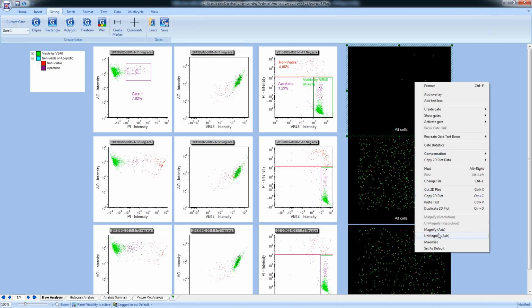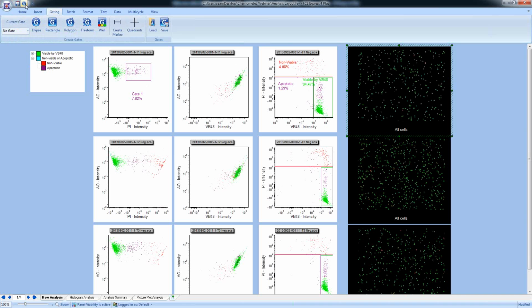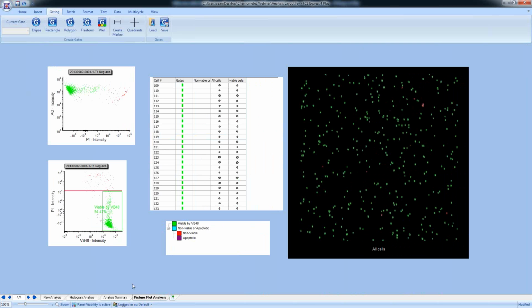And you can see here that because we've colored these in purple, when we zoom in on these, we can see that these are the cells that we've just chosen. So this is something that we're very used to doing in flow cytometry, by setting up gates and setting up hierarchical gates on many different probes and parameters. We can interrogate different phenotypes for our analysis, and you can always go back and figure out where these cells came from. Now that we have the image cytometry version, you can go back to the actual images.